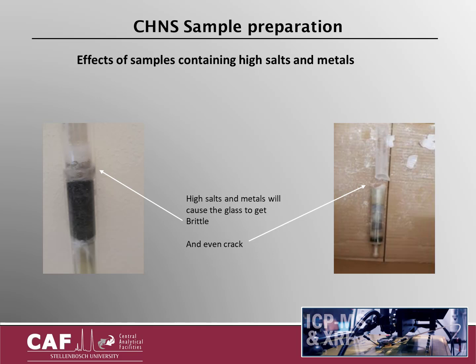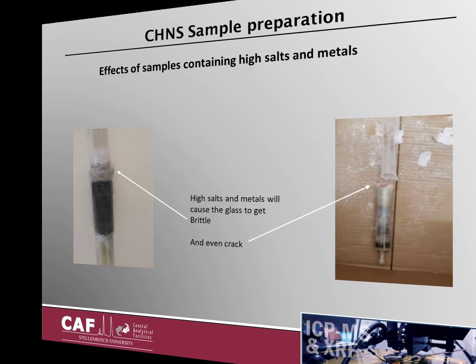Liquid samples cannot be analyzed due to the high risk of the sample leaking out of the boat. Samples containing salts will be evaluated, as high salt content can damage the tubes. It is therefore crucial that all available information about your samples are given to the lab to ensure proper sample handling and preparation for accurate data.